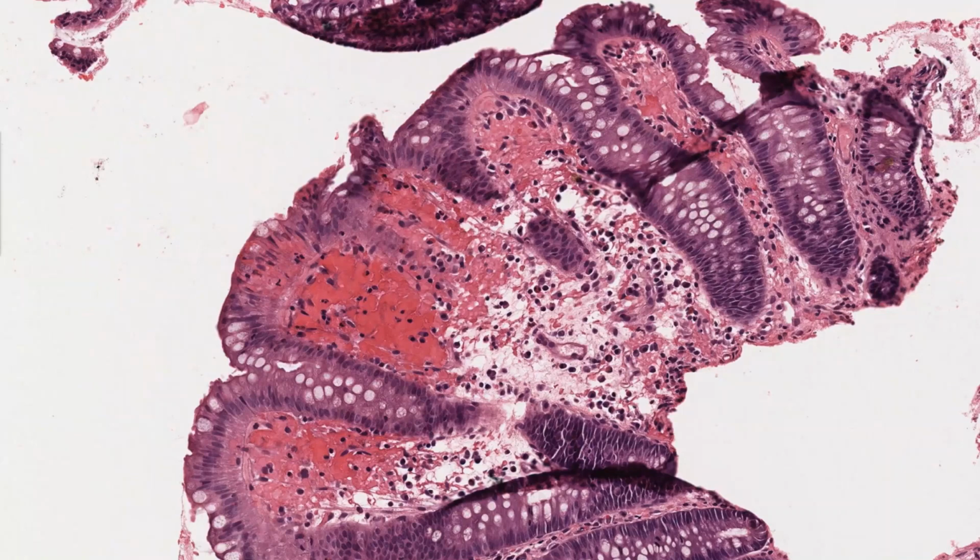When we read in the books and in the papers about ischemia, they always tell you that it doesn't have a lot of inflammatory cells. And in these examples, you can see that, because in these examples, you see all the features that have been described in textbooks.